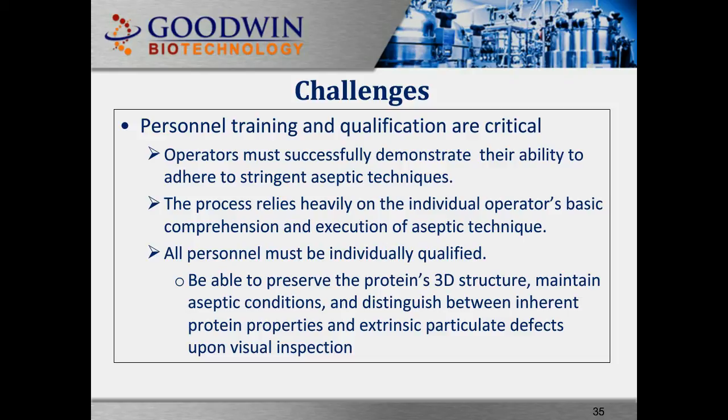All personnel must be individually qualified. They should be able to preserve the protein's 3D structure, maintain aseptic conditions, and distinguish between inherent protein properties and extrinsic particulate defects upon visual inspection.